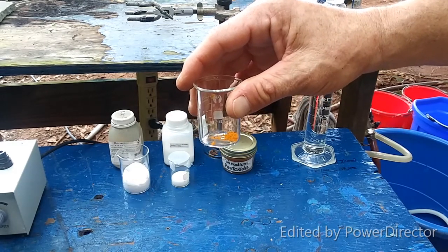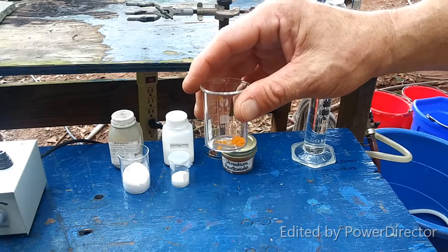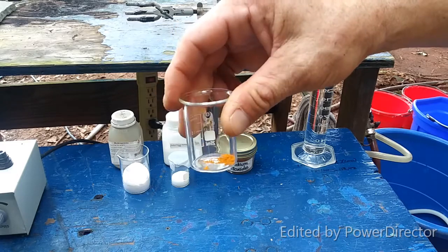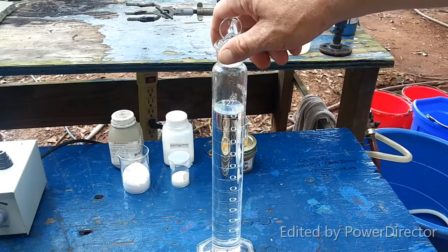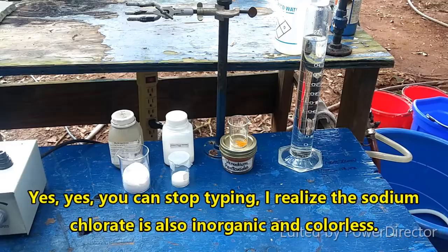What we have here is as close as I could get to 0.125 grams of vanadium pentoxide — not organic, nice and colorful. Funny how that always works out. And here we have 250 mils of 2% sulfuric acid — also colorless and inorganic, so I guess it doesn't always hold true.